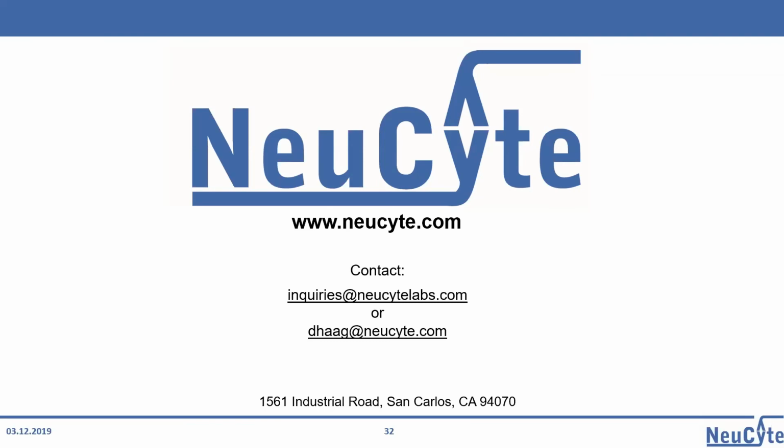Thank you. How long can the Synfire neurons be maintained in co-culture? So the standard assay time points are around 4 or 5 weeks, and depending on what you're looking for, especially if you want to go for extrasynaptic and NMDA receptor currents, you might carry them out a little bit longer. We have actually accidentally carried them out for almost a year, and they were still active and firing. But of course, the variability increases over time, and media is not so cheap, and maintenance and so on. So I would not extend them past 6 months, but if you have an assay that takes a 6 month time point, that is still doable.